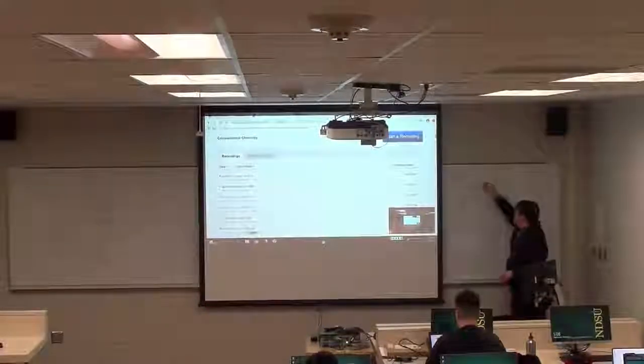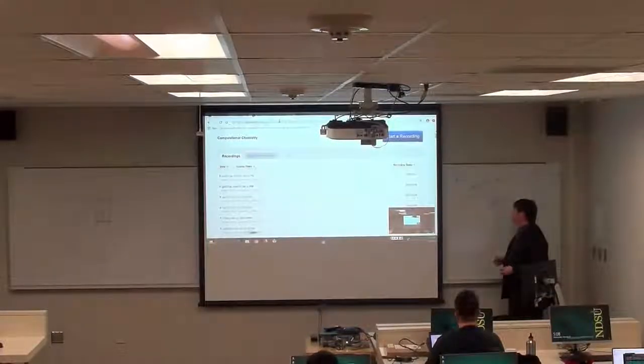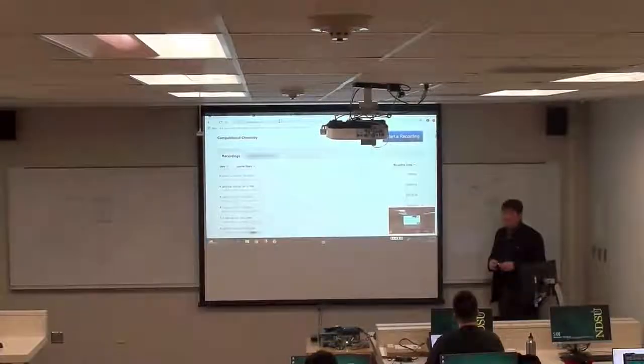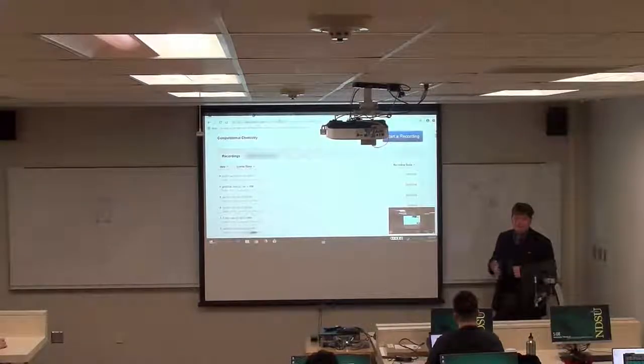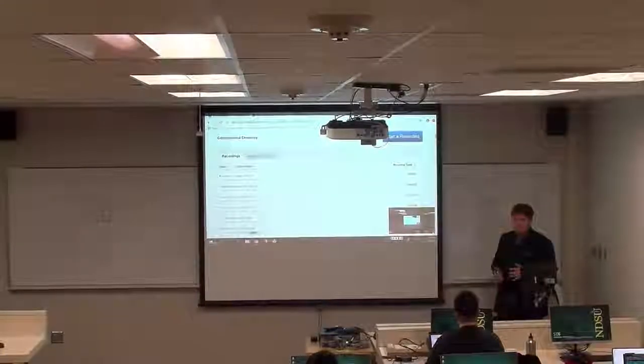So this is the neutral molecule with zero total charge. It's neither anion nor cation. The benefit of why we selected it is that it is as small as typical chemical molecules, but it has some inorganic flavor because it has a transition metal. And I will do it myself.